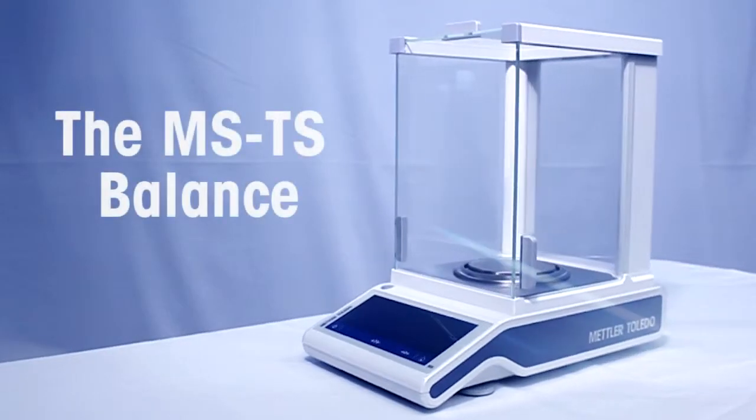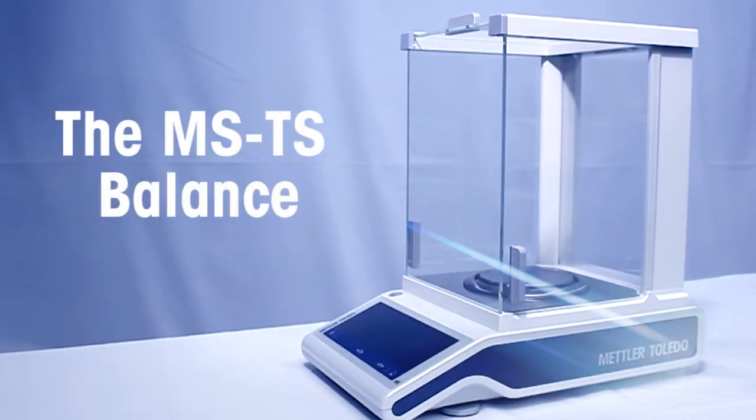Hi, I'm Dr. Bill McGovern from Mettler Toledo. I'm excited about our newest balance, the new classic MSTS and I wanted to show you a few things about it.